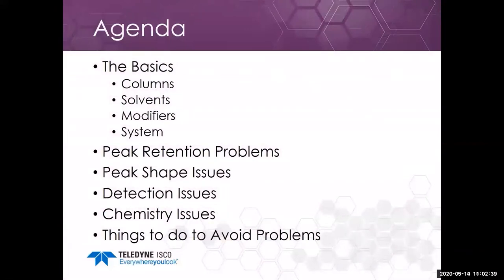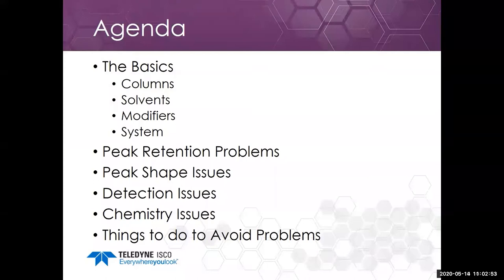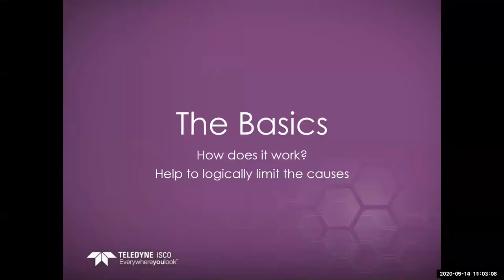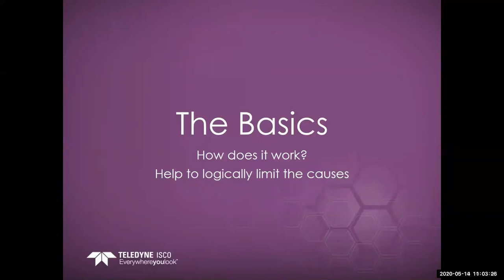We're going to go over the basics of chromatography first. We'll talk about peak retention issues, peak shape issues, what happens if your detector seems to be acting up, and a little bit of time on column chemistry — how your chemistry can cause your chromatography to act up and things you can do to avoid issues. By knowing the basics you can limit the causes. You can think about what you see, rule out certain failure modes, and logically determine where the problem lies.